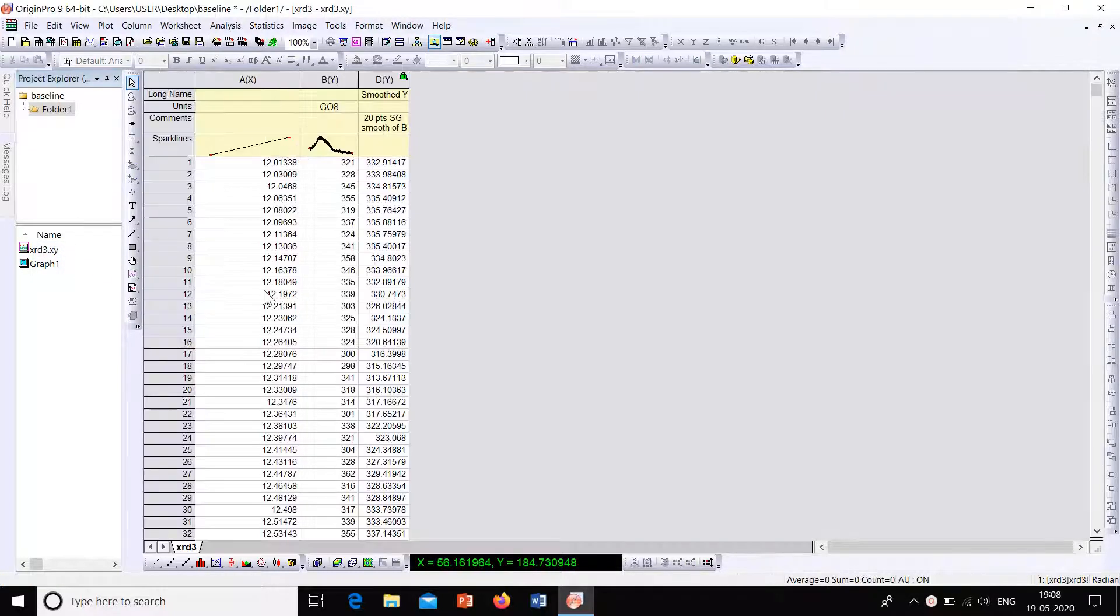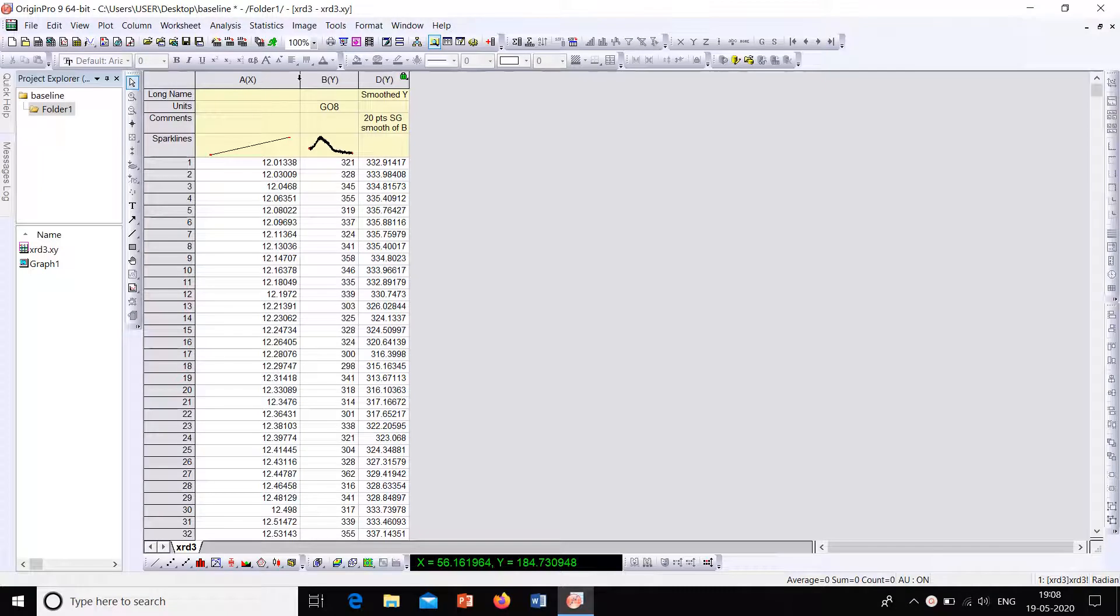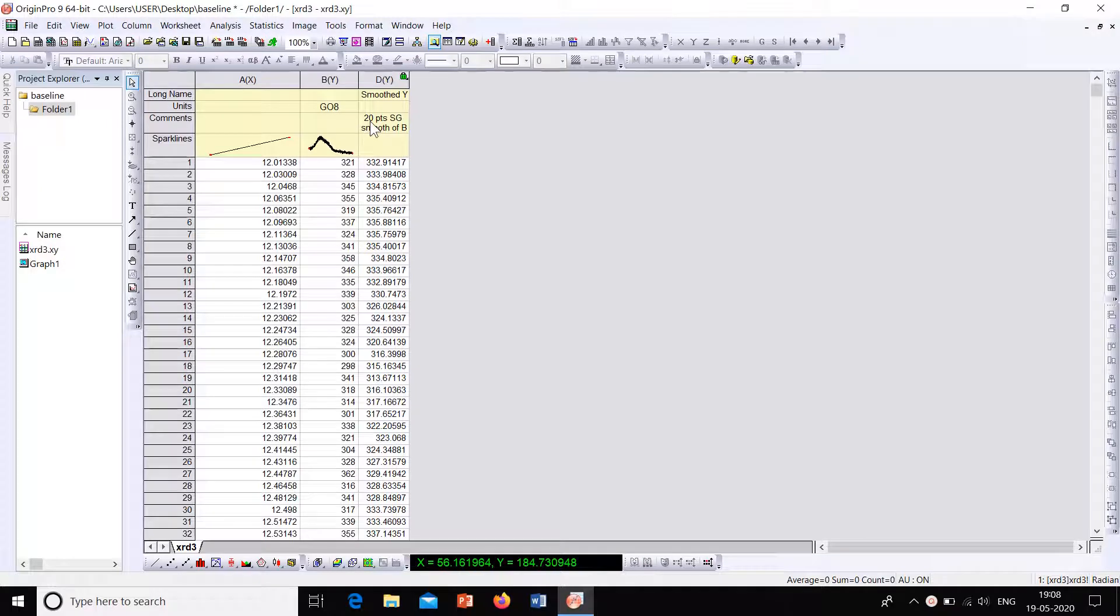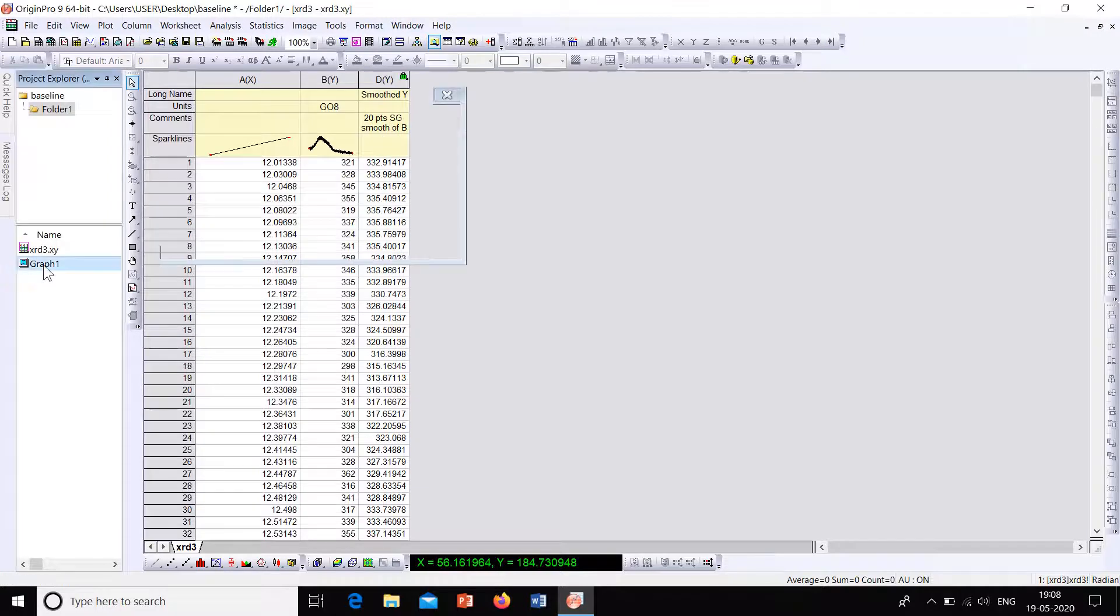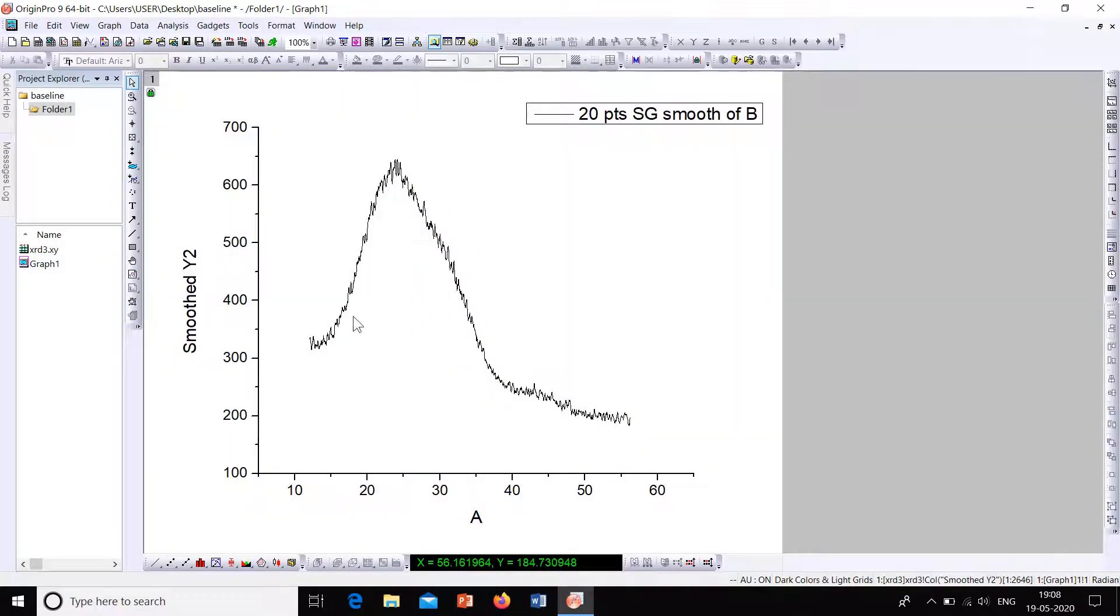So you can see here, this is the workbook for the plot. Here X and Y is here and this is the smoothed points. So we have selected smoothing for 20 points. Points of the window was selected as 20 and this is the plot that is obtained.